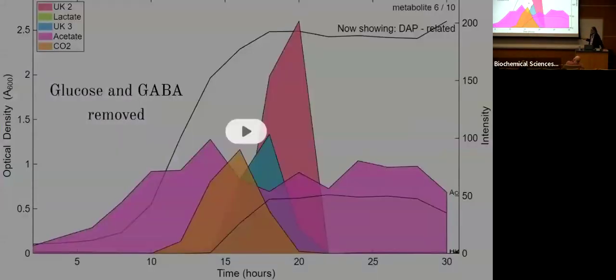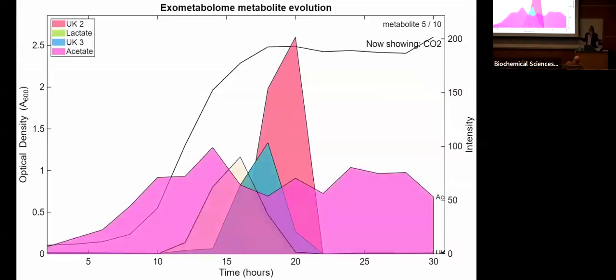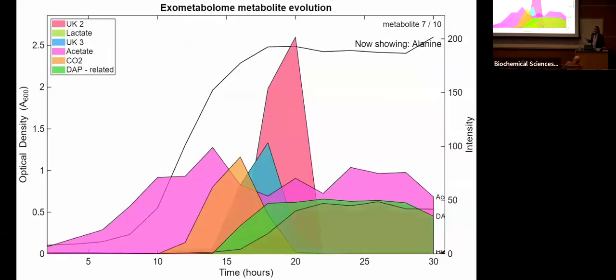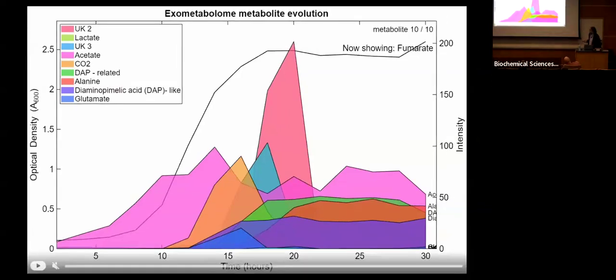This now shows without those two, and a similar sort of time course of other metabolites. We actually know a lot less about the media right now because it has a little bit more pH variability and some compounds that we weren't necessarily expecting. So we're trying to take this data, put it into E. coli type pathways and try to use it for flux balance analysis type applications. Okay, that's it.